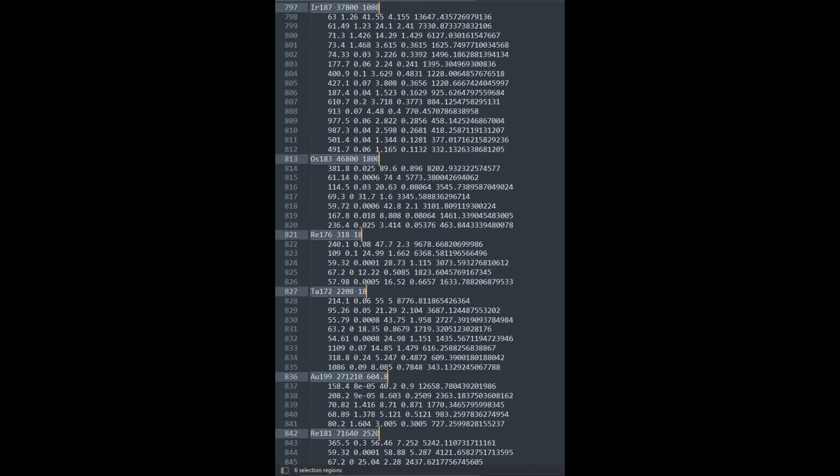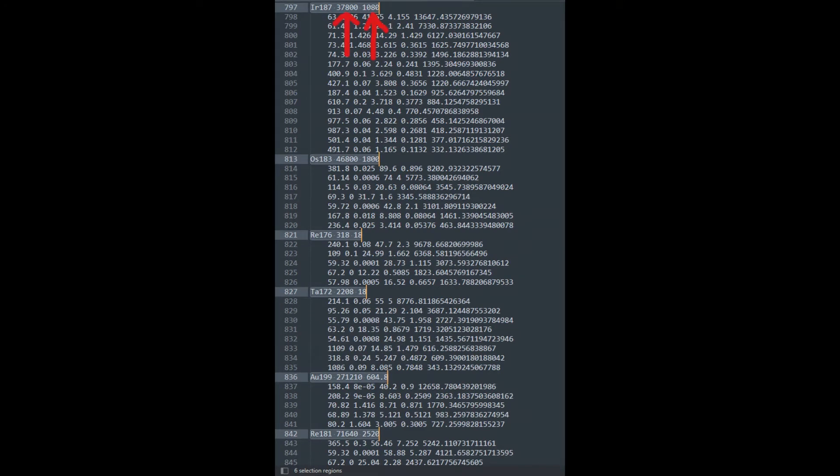Each of these highlighted lines represent a nuclide and the numbers to their right are their half-lives and uncertainties on their half-lives.